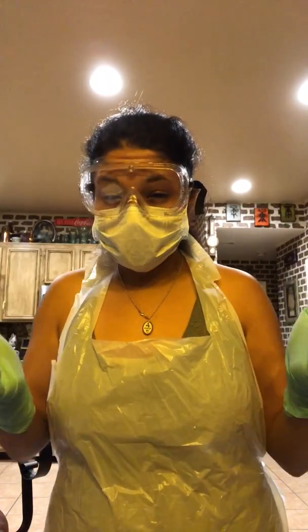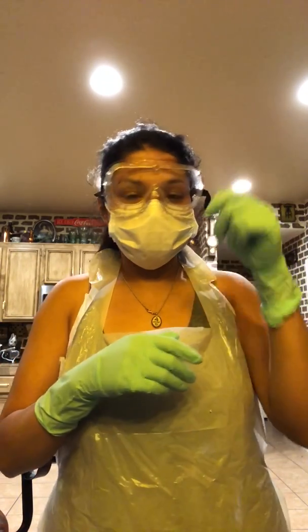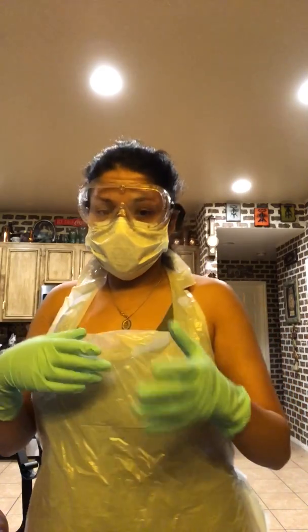Unfortunately, for some odd reason, I didn't film myself diluting the yeast, so I will be telling you exactly what steps I took.